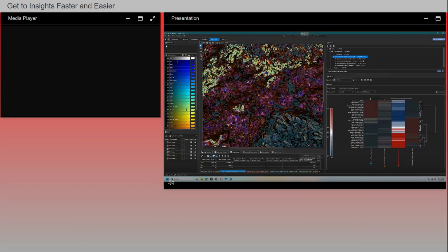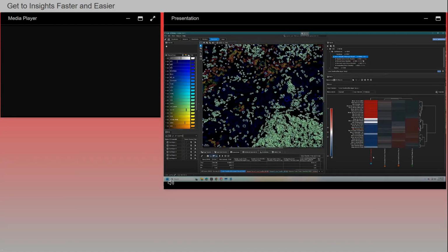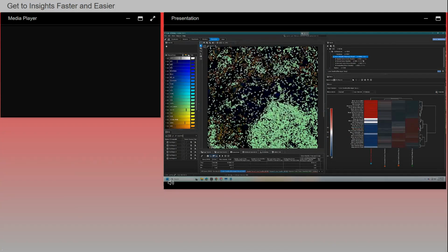In addition, let's say you're interested in a particular type of measurement. You can select a measurement, sort your clusters based on that particular measurement, reset, and really have fun exploring your data on a really deep level to understand what you're observing in your particular data.